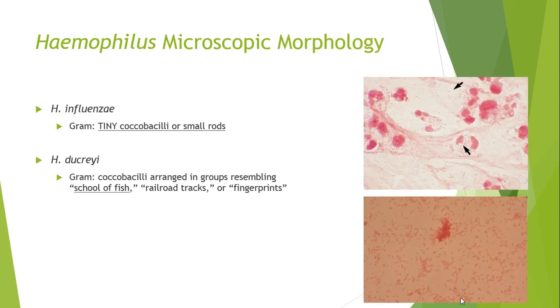Oh, here's some more pictures. Haemophilus influenzae, teeny tiny coccobacilli. I can't hardly see them here, can you? You can probably see them better in your book. They're better here. This is Haemophilus influenzae too, probably from a culture plate because there's no white cells and no proteinaceous debris. So it's more concentrated, but very teeny tiny. And notice that we see them kind of inside white cells. They might just be laying on top of white cells. They may be intracellular. I don't know.